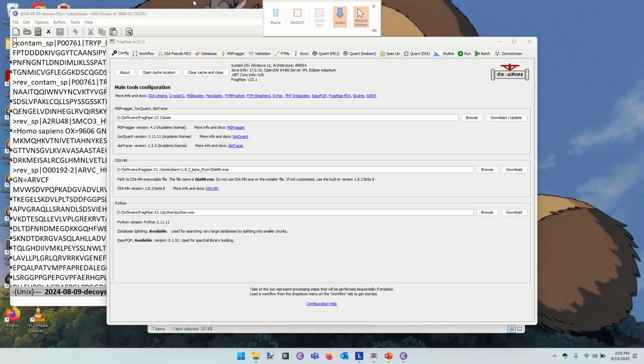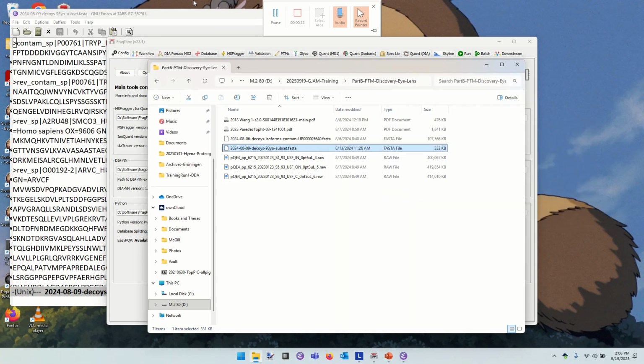Welcome to part two. I'm really glad you could be here this afternoon, and we will talk through an interesting problem in proteomics. How can you judge which PTMs you should look for in a DDA proteome? In this case, we are dealing with eye lens material from a person who was 93 years old at the time of donation. Maybe this was surgery, maybe it was postmortem. I'm not actually sure in this case.